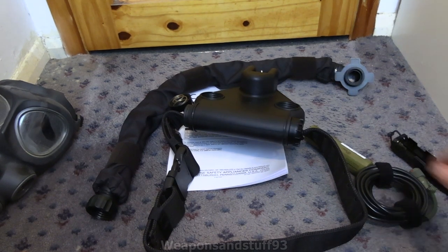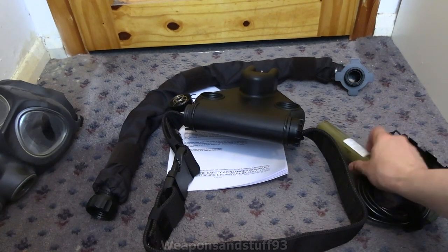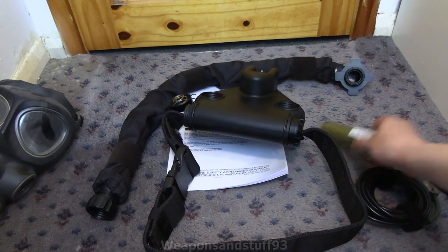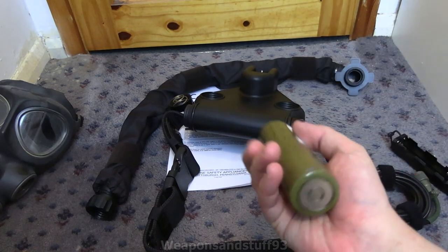This has come with a lithium battery in it, but I think what Steve does is provide you with one of these — basically an eight-cell AA adapter to make it work like one of those lithium batteries, so it plugs in as though a lithium battery would so you can power it on regular batteries. The default batteries C420s use are basically like these.